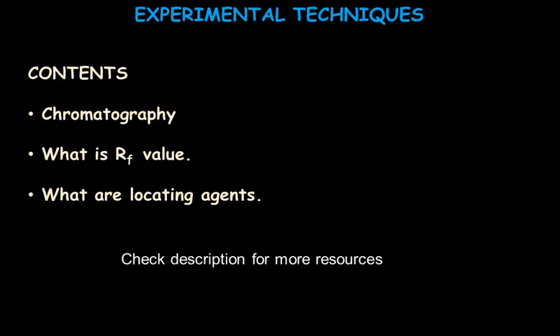As we had already seen in our earlier video, chromatography is one of the experimental techniques. So the IGCSE chemistry topic chromatography we'll be learning this time in detail. Let's also understand what is Rf value, and let's also see what are locating agents in relevance with chromatography.